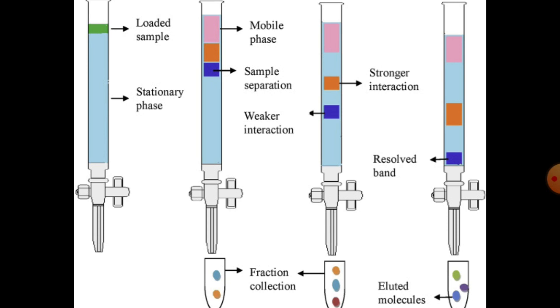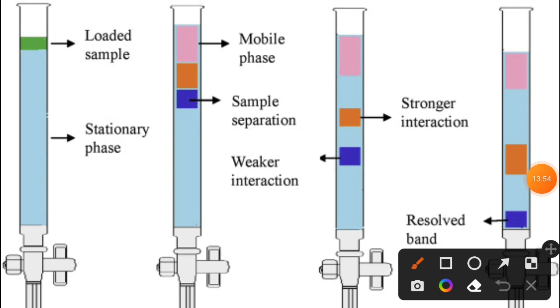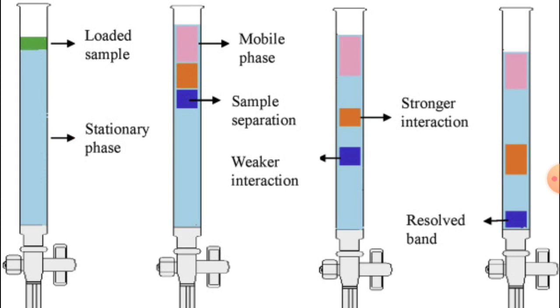So that means air bubbles can be formed between the solid phase and mobile phase during your packing step. If dry packing occurs, then it will ultimately promote cracking in the adsorbent layer that will affect our result. That is why you require good technical skill for packing the column for column chromatography separation. Otherwise it can affect your result. That is why it is quite difficult and requires good technical skill, okay.